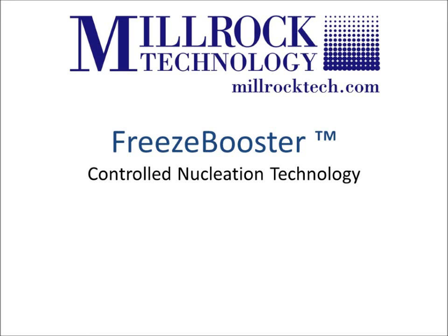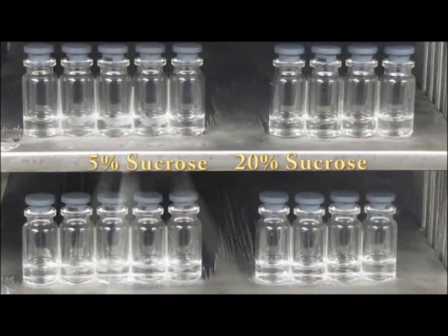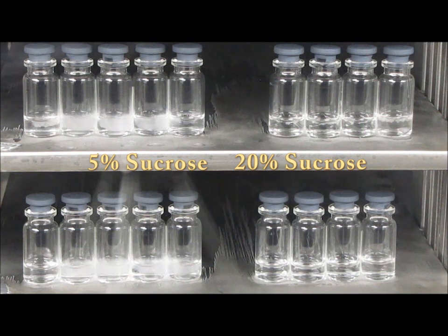Freezing without controlled nucleation may result in different crystal structures and inconsistent pore sizes in the product, resulting in longer primary drying cycles. To produce a consistent crystal structure and pore size, a method of control is required that will nucleate all of the product in the freeze dryer at the same temperature, time, and rate. The freezing step is considered the foundation to a repeatable and efficient freeze drying process.